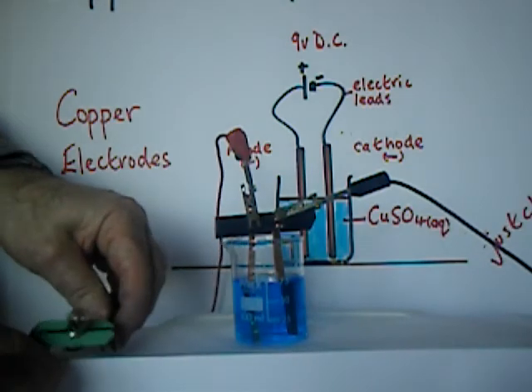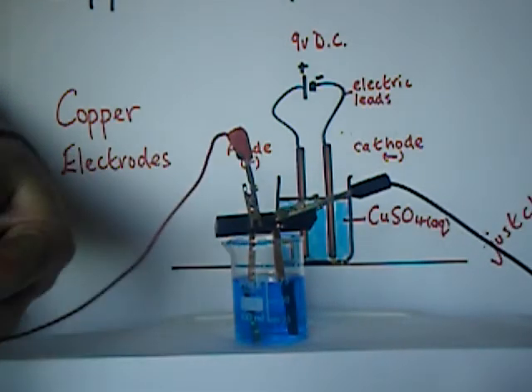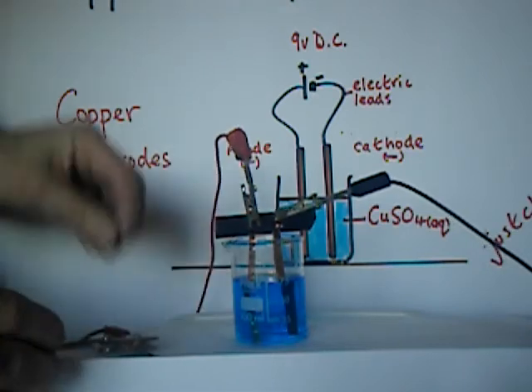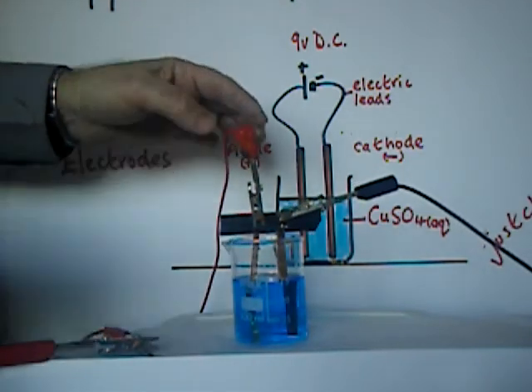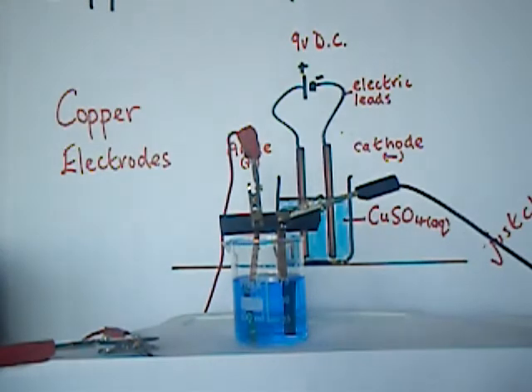I have to have shorted that out. So I'm going to remove the bulb. We now have the current flowing here. We'll let it go for a moment or two there. See what happens. Now I did one of these earlier.